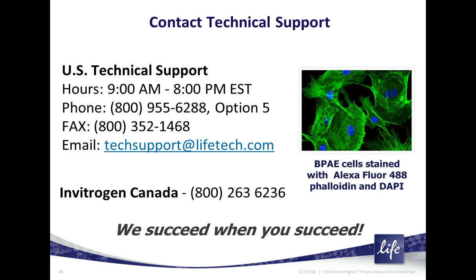Can antifade reagents work for any dye and any wavelength? Not really, actually. They'll work to some extent, but some dyes work better with different antifades than others. Now, our antifade mountants, ProLong Gold and SlowFade Gold, work for most any dye, but there are a couple that it's not as good for. For instance, our Alexa Fluor 532. Not much works for that dye, but generally it'll work for pretty much any of them.